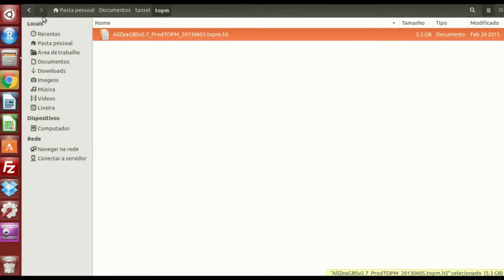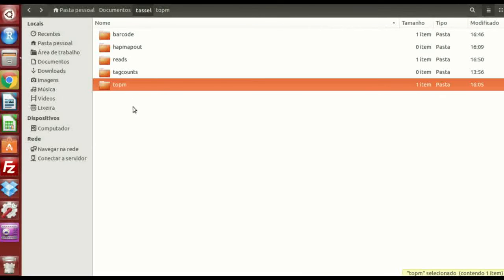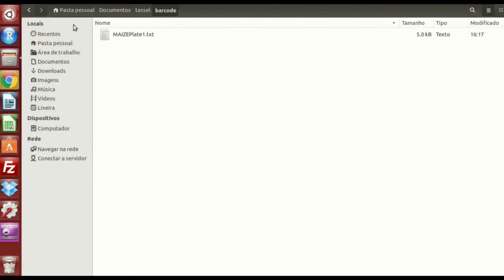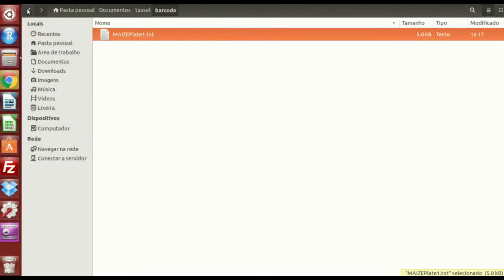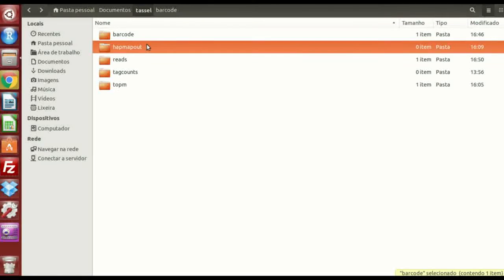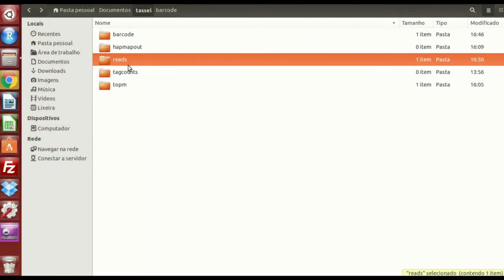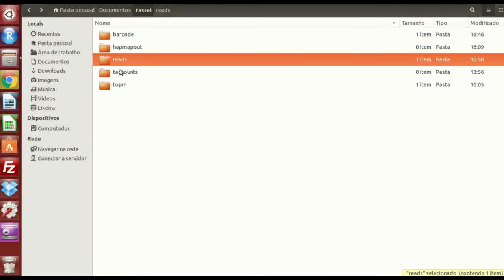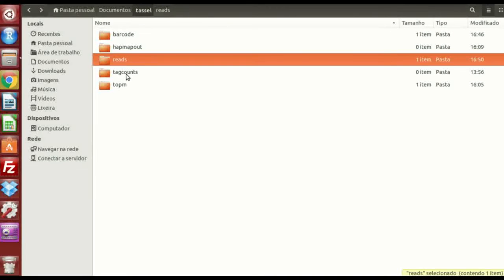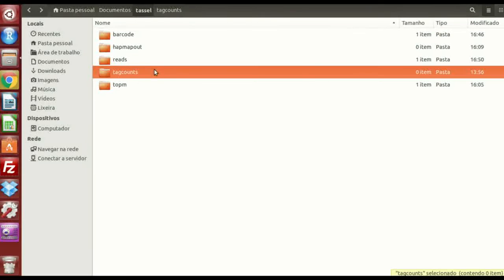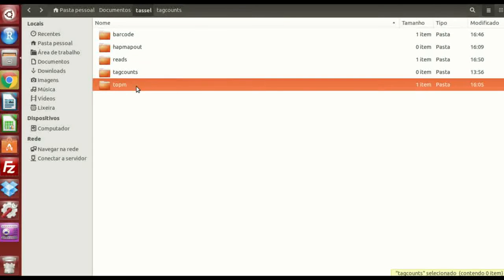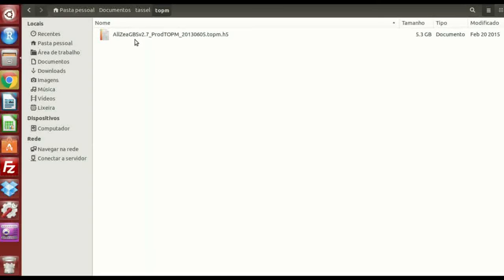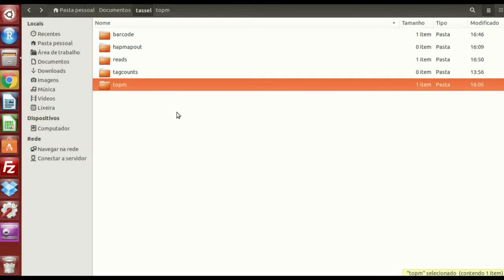Okay? So you download it and put here. Now that you have all the files set up, you have the barcode file, barcode key file. Hap map out, where your results gonna be. Reads, where your FASTQ files are. Tag counts, you're gonna leave empty. And the topm file, which are tags on physical map.